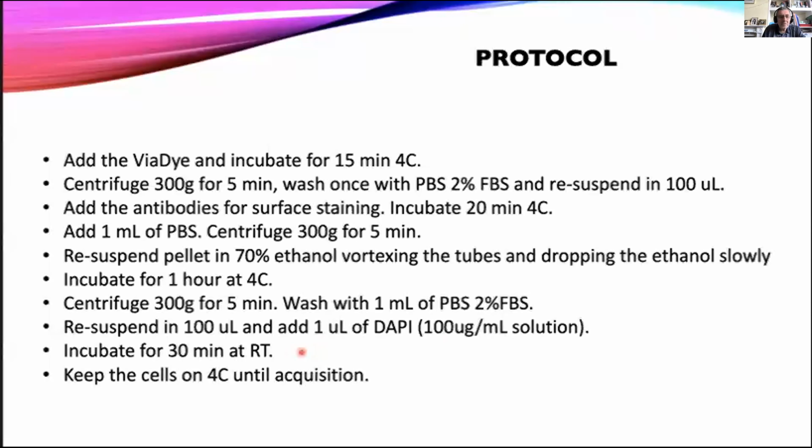With my DNA binding dyes, I always incubate them for a while. In fact, overnight incubation is sometimes the best way of doing it. It means you can do the staining late afternoon, put it in the fridge, and come back tomorrow. But here we've just done this for 30 minutes.